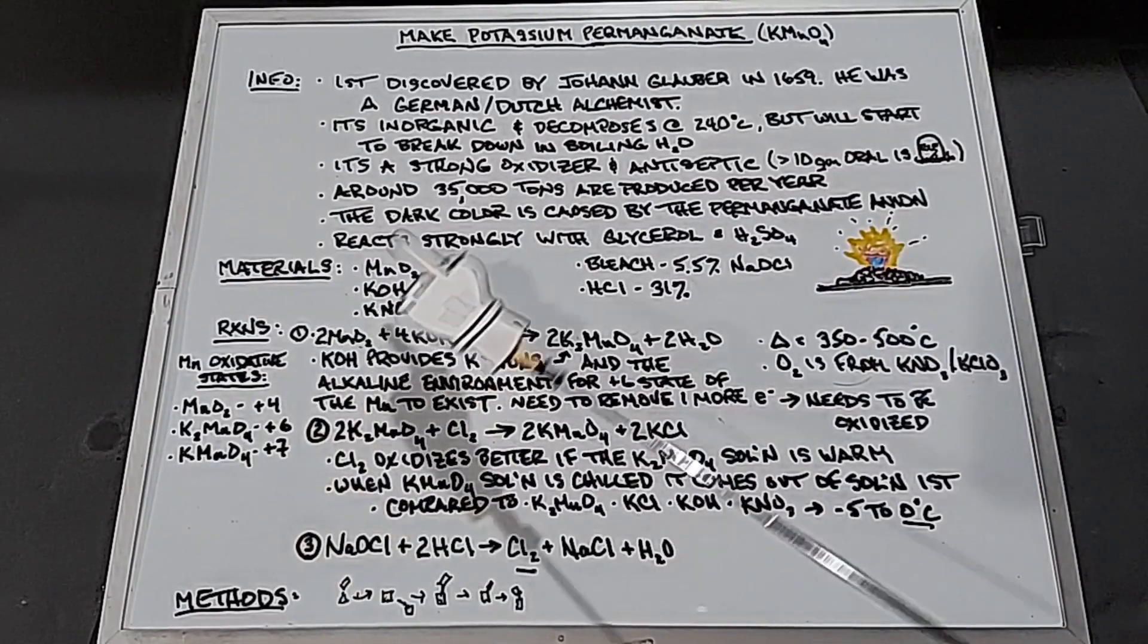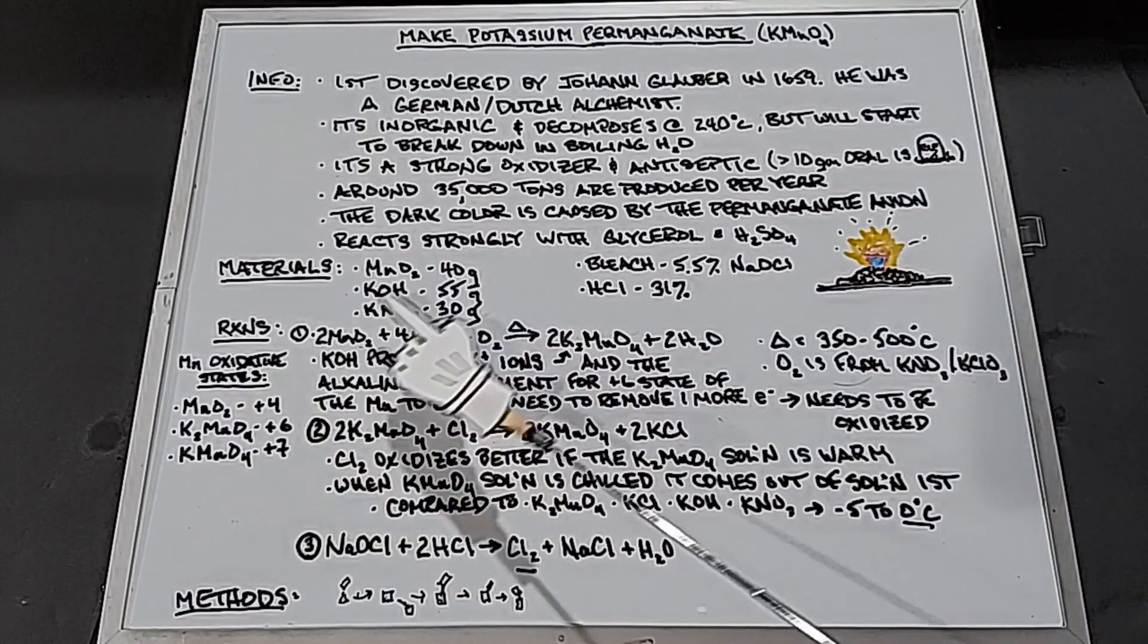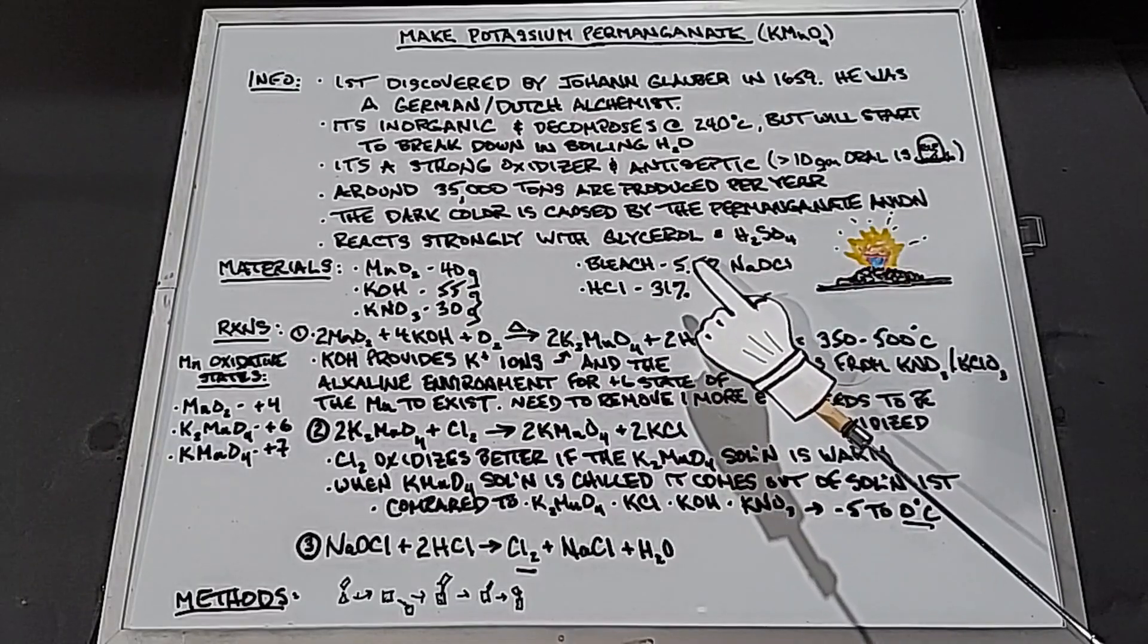The materials we're going to use are manganese dioxide, 40 grams, potassium hydroxide, 55 grams, potassium nitrate, 30 grams, and later on bleach, which will be a five and a half percent solution, and hydrochloric acid at 31%.